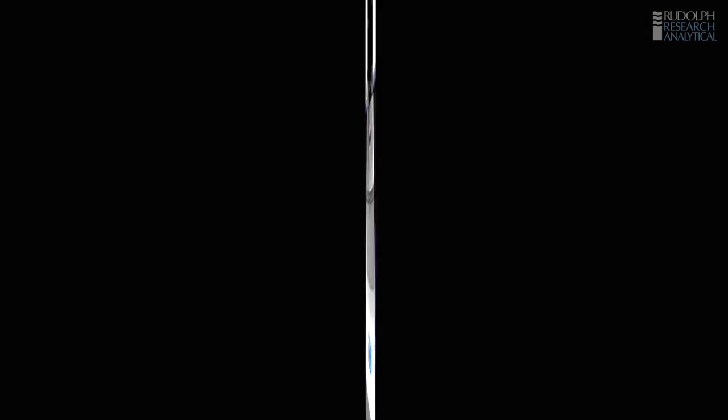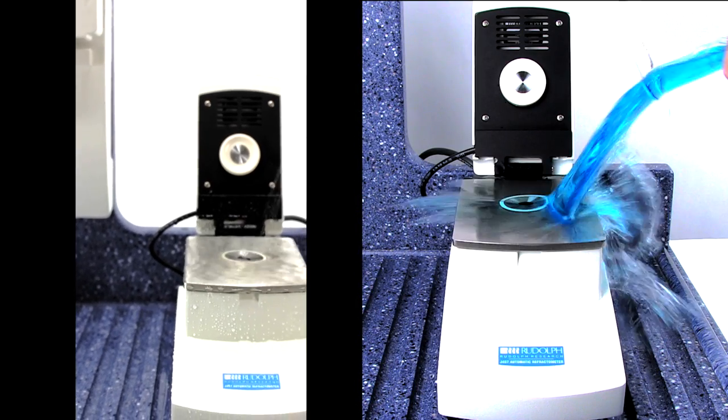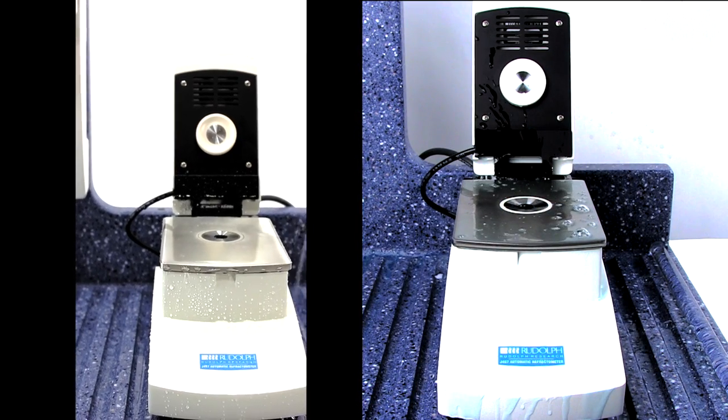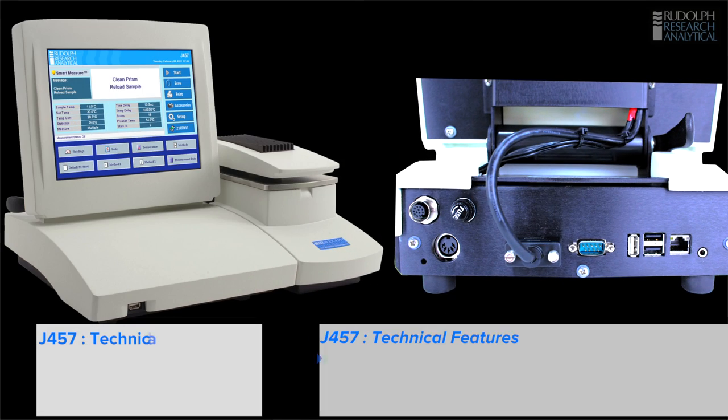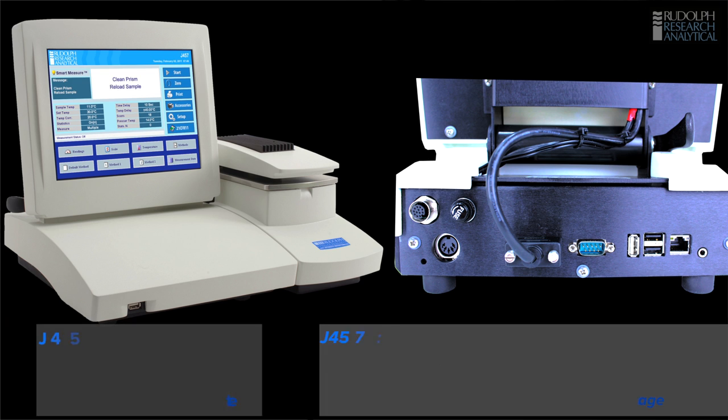The J457 has a separate measurement and display system. This means that if you're putting a sample on and spillages happen, as they do in a laboratory sometimes, no sample gets inside the instrument — it's completely waterproof. The J457 also features modern computer connections. On the instrument is a USB drive at the front to allow easy transfer to a stick. It can be connected to a network using the network connection or the USB drives on the back.